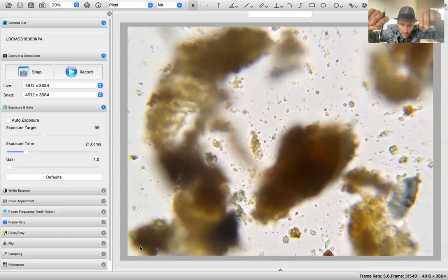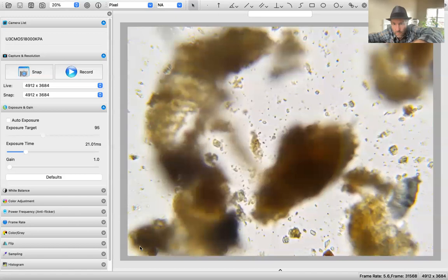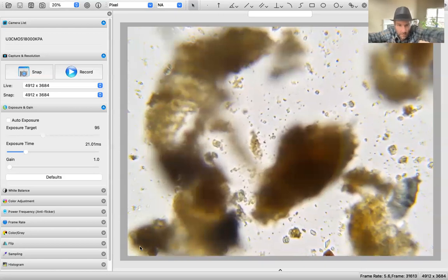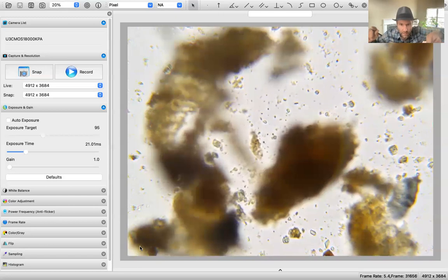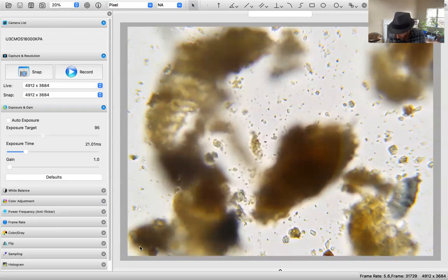That's a tricky one. I can only count what I can see. So we're going to count. It's going to be, I want to say, roughly a 2, 2, and 2. And it's a 1.5, 1 3/4. No, it's a tough one. I'd say it's a 2, 4. I'm going to say 6. I think that's a fair assessment. Okay, and that's a 0.6 for actino. And we are on field of view 1, so 0.6.